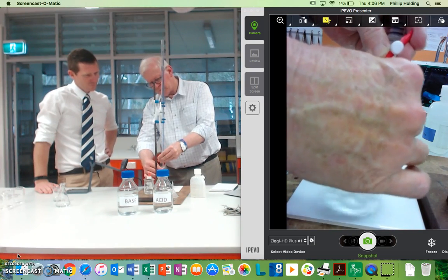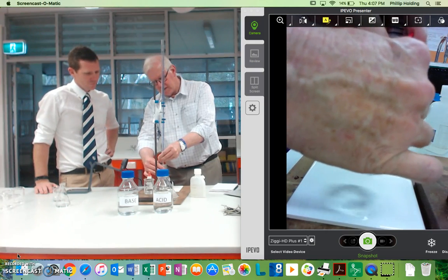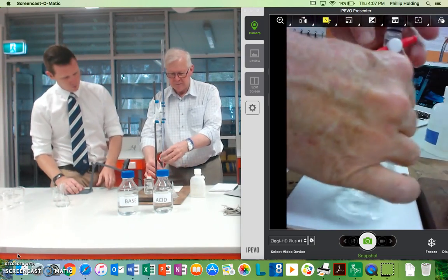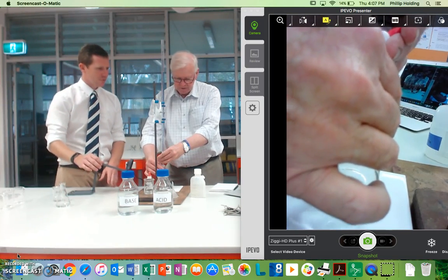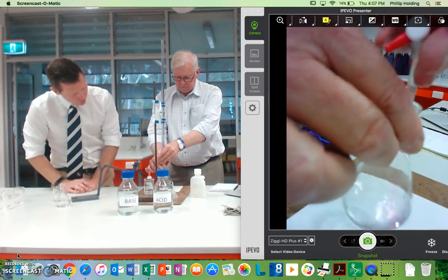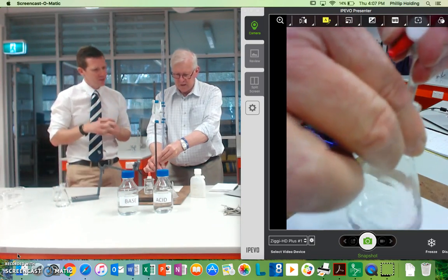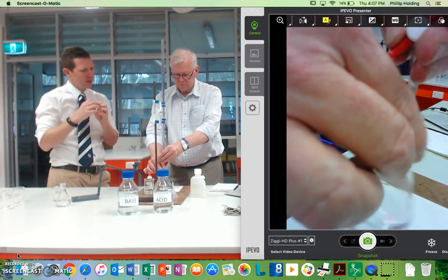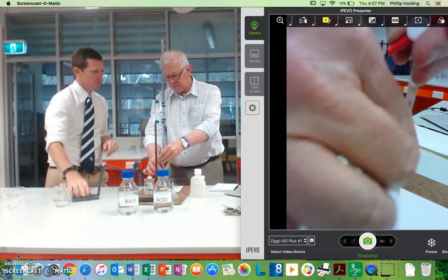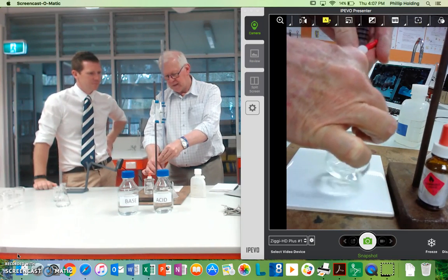Now as you do a titration, the reason we swirl is that we want to mix it really well. When you put a drop in, as you get close to the end point, the pink color stays because it's concentrated — it's not mixed. So we put a couple of drops in. We can see the drops dropping in there, and when they hit they go that vivid pink, and they disappear very quickly. So as it becomes closer to neutral, what will happen to the length of the pink drops? They'll take longer to get rid of.